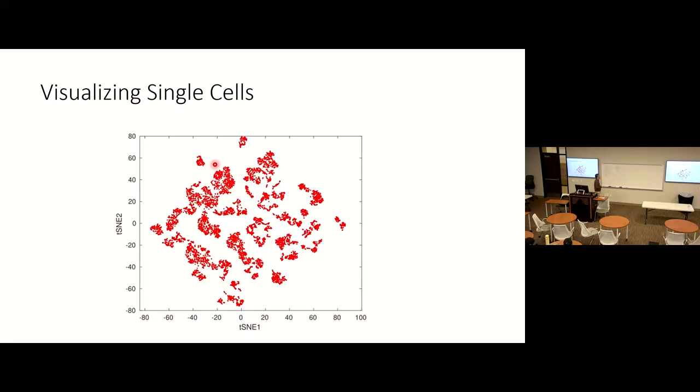This lecture will build on all the previous lectures we learned. We learned about vectors and rotation matrices, that's for PCA. We learned about the probabilistic generative model. To me, t-SNE is most like a generative model. You generate the positions of the cells depending on your understanding of the distribution of cell-cell relationships in the high dimensional space.